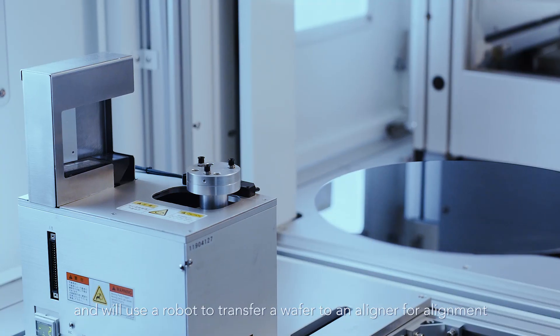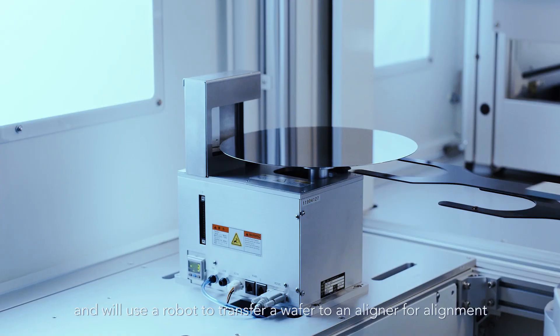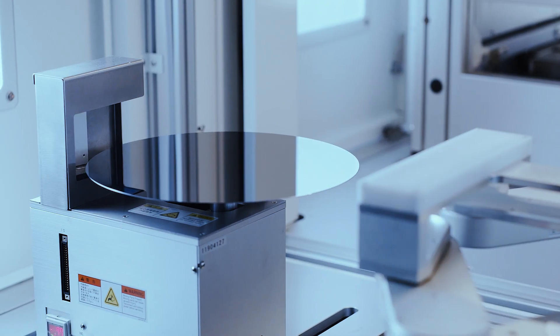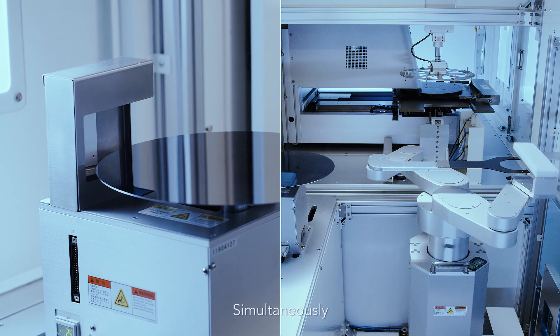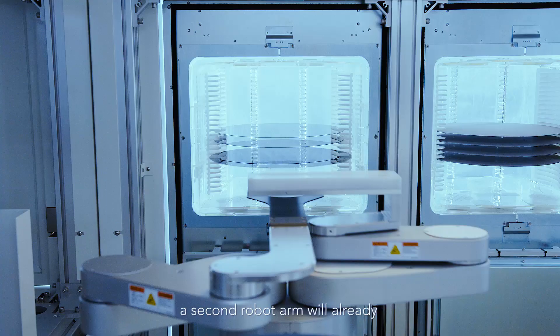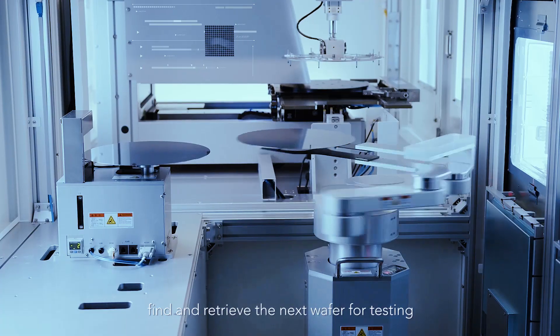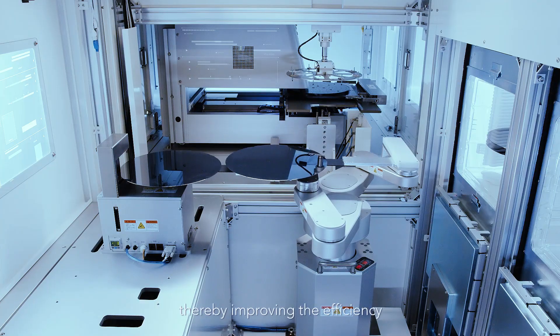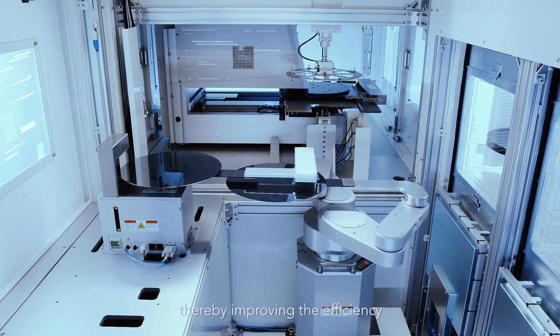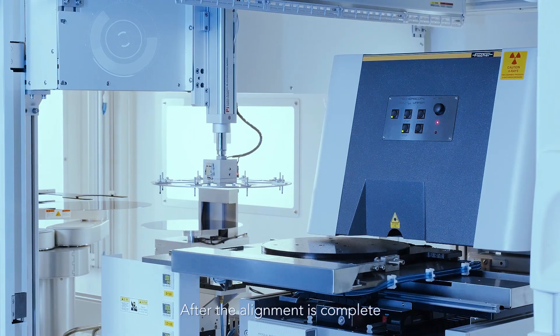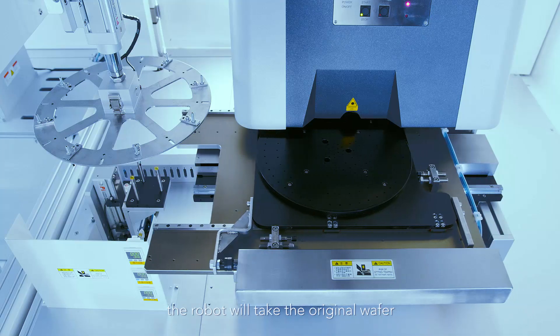A robot transfers a wafer to an aligner for alignment. Simultaneously, a second robot arm will already find and retrieve the next wafer for testing, thereby improving efficiency. After the alignment is complete, the robot will take the original wafer and place it on the table.